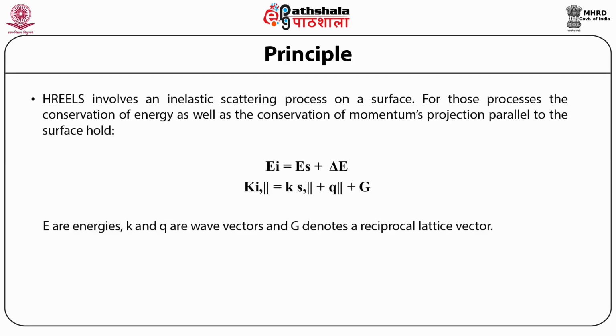HREELS involves an inelastic scattering process on a surface.